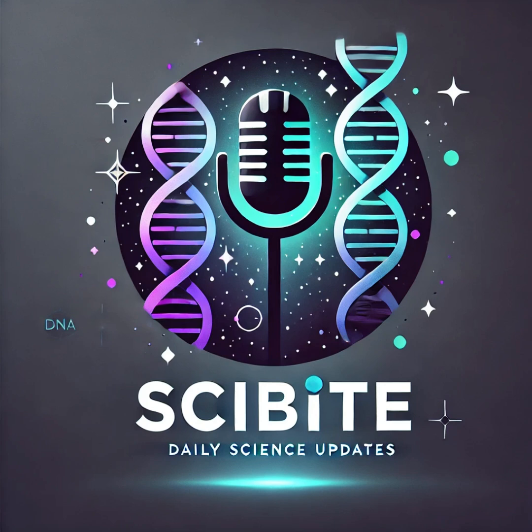Before XLDOT, scientists were really limited in their ability to see the 3D arrangement of these really tiny nanoscale structures within materials. Imagine trying to understand a complex machine just by looking at its shadow. You might get some clues, but you're missing the full picture. XLDOT is like turning on the lights and seeing that full picture. It shows us the orientation of individual grains or domains within a material.